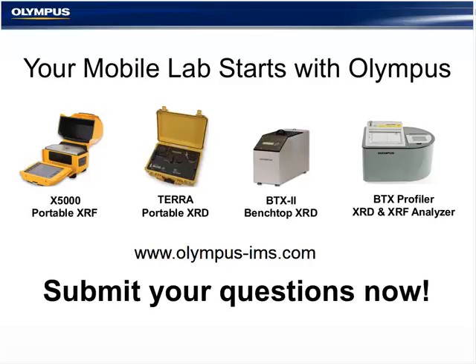Dawn? Yeah. You know, a question I get all the time is, how are you representing thousands of feet or, you know, an enormous amount of rock with such a tiny little sample that goes into the XRD? And the real key for this, although the machine does require just a tiny bit of powder in order to operate, the bigger your initial sample is going to best represent what's going on downhole.